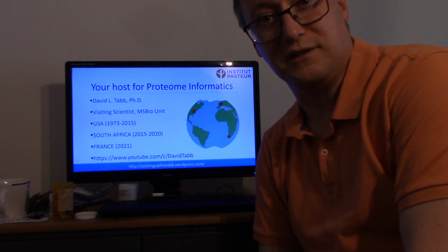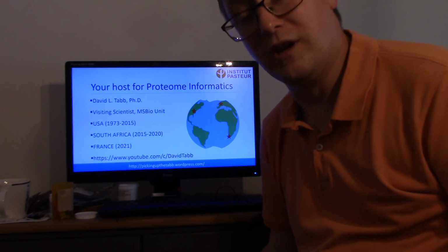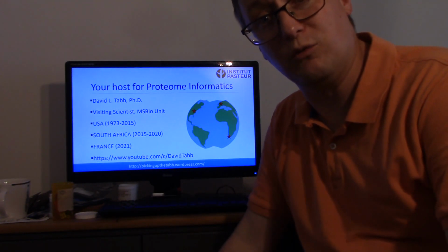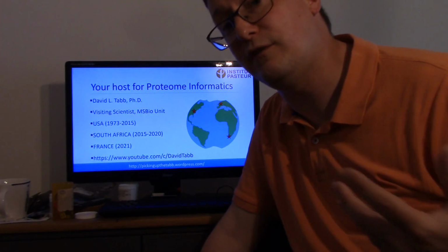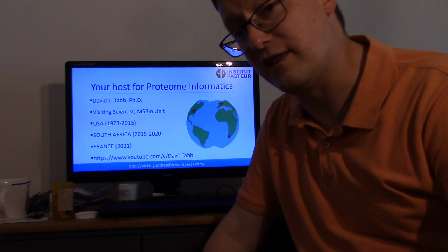Today we're going to cover 6 different topics, all strung together in one long video, but we've broken it up into about 20-minute segments that we're going to walk through bit by bit to increase our understanding of how we identify peptides and thus proteins in proteomics and how we quantify them.